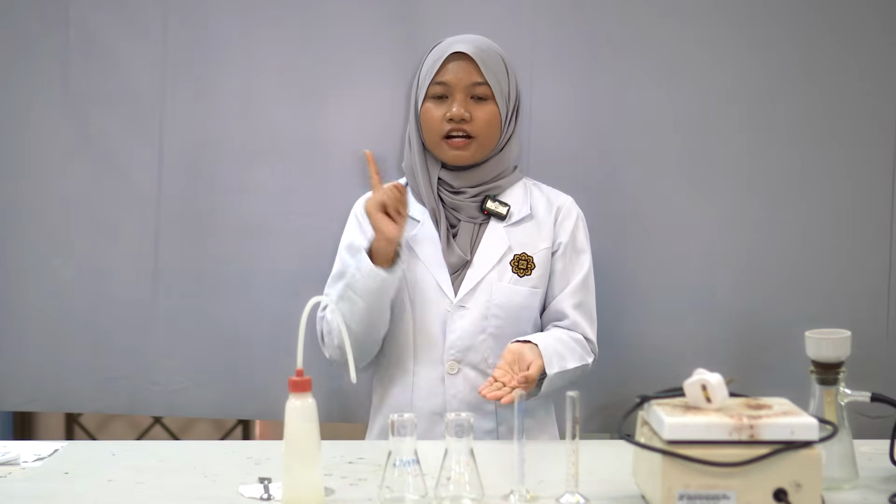Then, a good solvent must have a boiling point between 50 and 120 degrees Celsius so it can easily evaporate. Lastly, the solvent must not react chemically with the compound being purified.